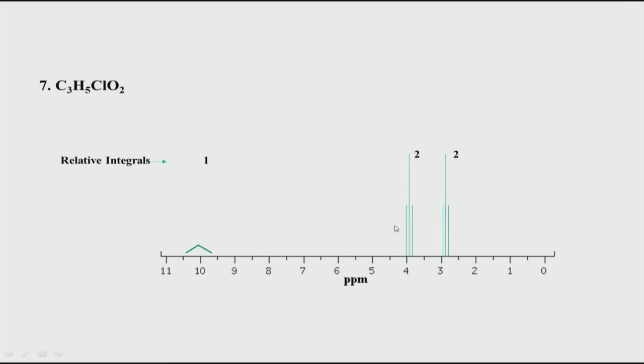Now you can see there is a 4 here, which means there is an OCH group present. Only if there is an OCH group do we expect to see a peak somewhere between 4 to 5 ppm. So, there is an OCH group, but then the next one has a chlorine, which is also an electronegative atom. Therefore, there is a hydrogen attached to a carbon bearing chlorine, and that is also getting downfield shifted. So what could be the structure which will satisfy this particular case?